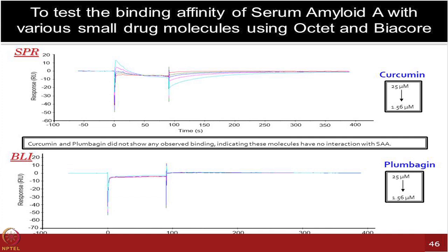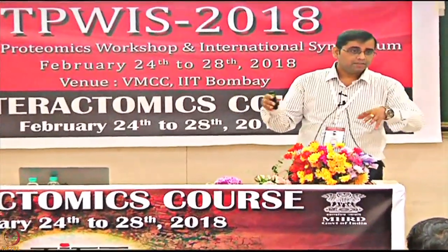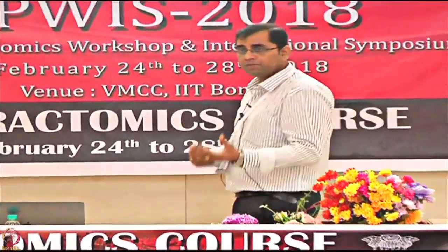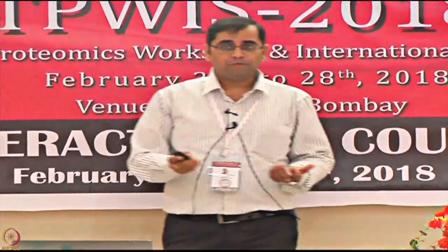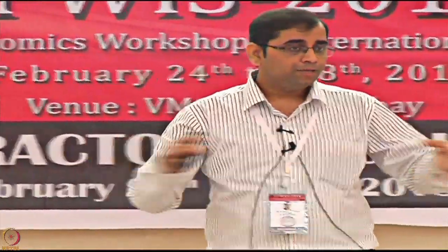So what I want to convey is that many times, don't just rush to one technology platform. Think about the cost if you have to test many compounds, and what the variations of those experiments can be. Start with platforms which can narrow down your leads and hits, then do the final experiments on something really acceptable. And of course, if you have a huge amount of funds available for the project, then you can do everything on the same platform. Otherwise, you can mix and match and choose which technologies can give you what.